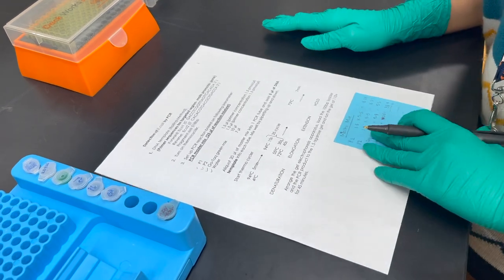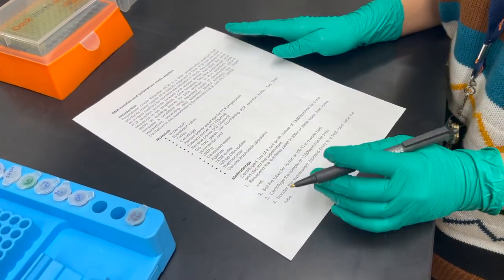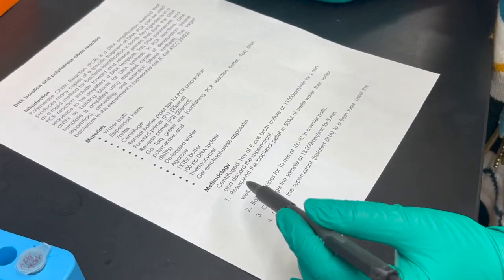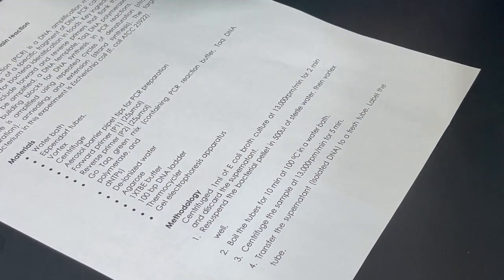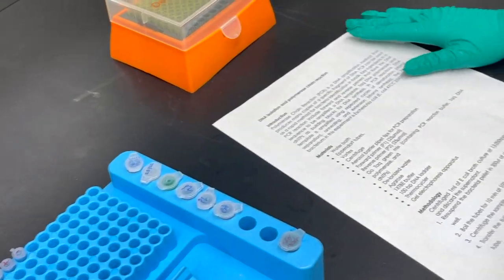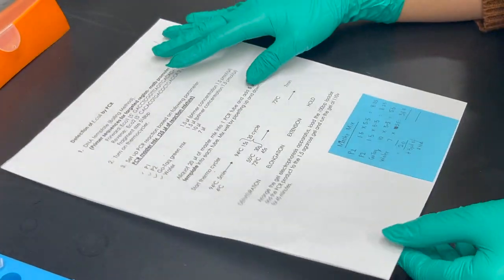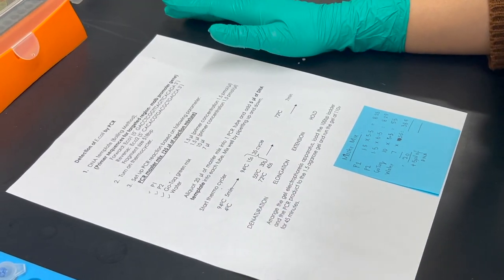Hello class, so today in this experiment we are going to do the detection of E. coli DNA using the polymerase chain reaction. In the methodology, we have already isolated the E. coli DNA. I can post the technique and procedure for how to extract the DNA, and then we will proceed with the PCR today.